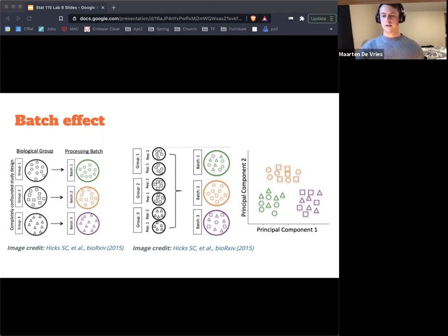All right. So if you're unable to avoid batches, they might be inevitable sometimes, then don't confound your experiment by batch. What you should do is, again, split the replicates of the different sample groups across batches, and the more the better. What you also can do is include this batch information in your experimental metadata, so then you can regress that out later during the analysis.